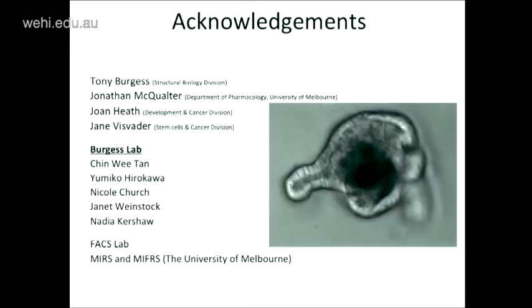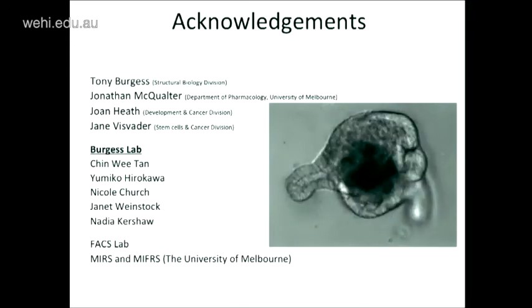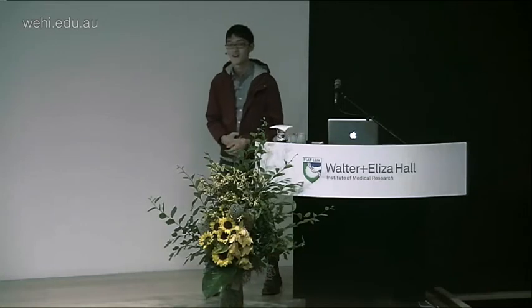Great talk. I presume that all the work is done with mouse crypts, right? Yes. So the antibody microarray, I think it's an amazing idea. Is it mouse specific or human specific? It's a mouse-specific microarray.